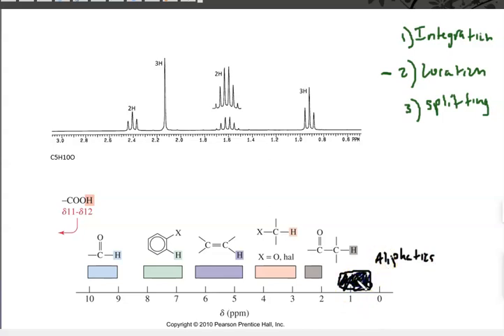Okay. So start at this peak here. Remember, draw a carbon with 4 groups. Same thing here. Draw a carbon with 4 groups. Carbon, 4 groups. Carbon, 4 groups. Start filling in all the information on each carbon that relates to the corresponding peak. Okay, so for right now, I just want you to do that part of it. And then see if you can come up with the structure, and then we'll go over it, all right? I'm going to put it on pause.